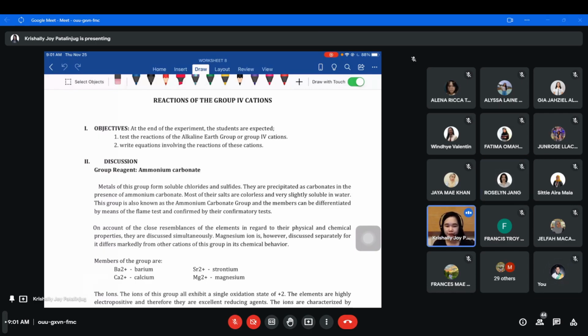Morning, we will have the pre-lab discussion for qualitative analysis of group 4 cations. Let me record this session.